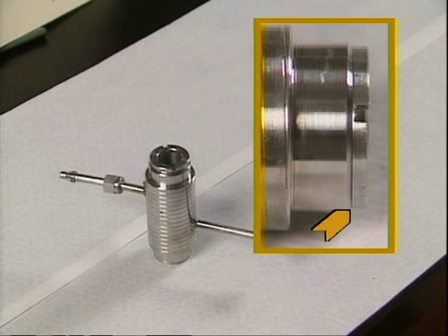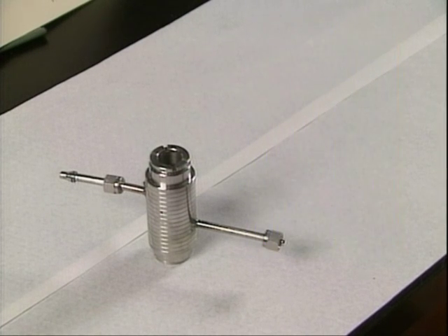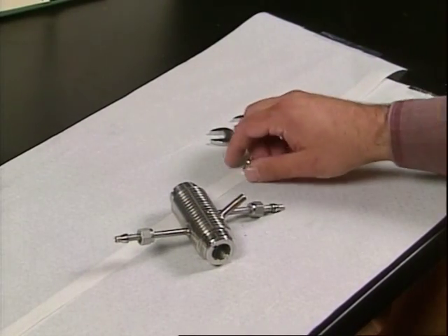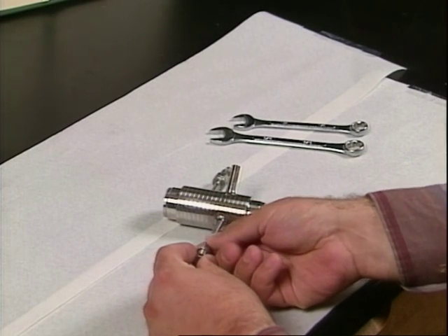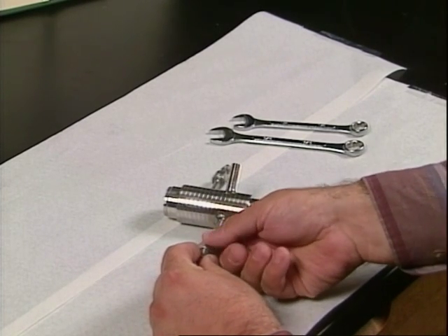If the O-rings are Teflon, greater torque and longer pauses will be necessary because Teflon is not as pliable as rubber. To avoid cell damage, do not use the cell inlet or outlet stubs as levers as you tighten the locking ring. After the cell is reassembled, conduct a leak check to ensure that process sample will not leak out and damage other analyzer elements.